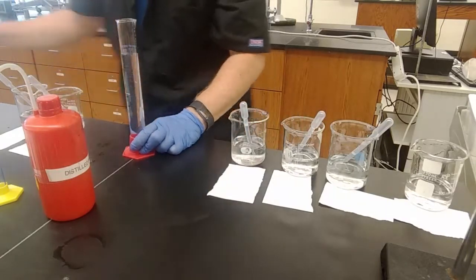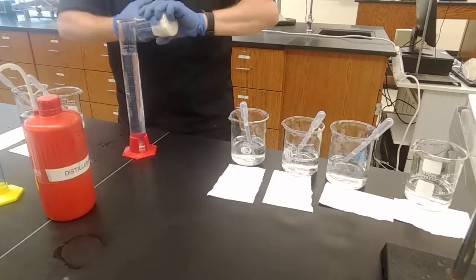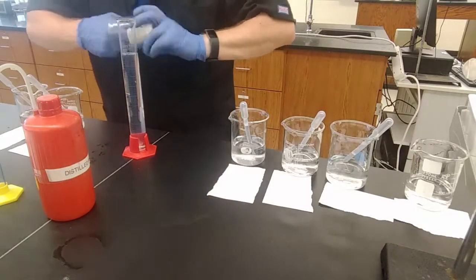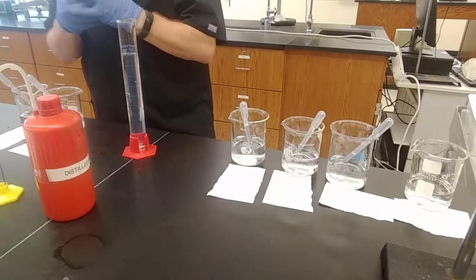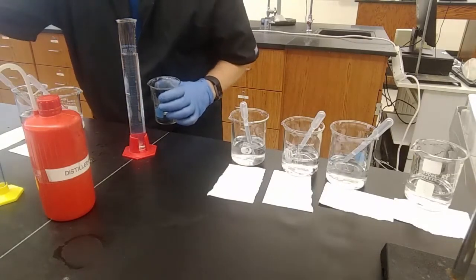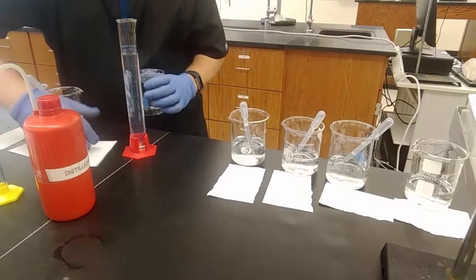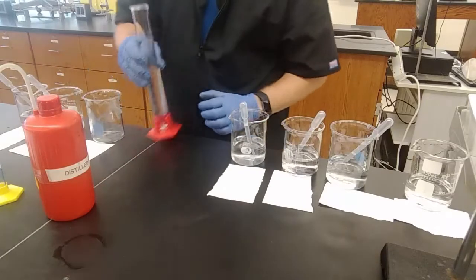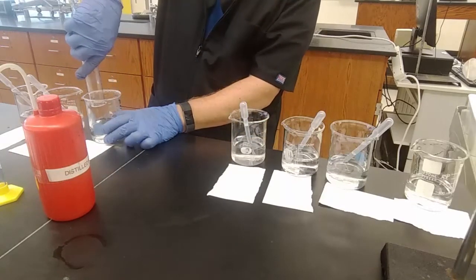Can stay where it is. New beaker labeled 11. Counter. In you go.